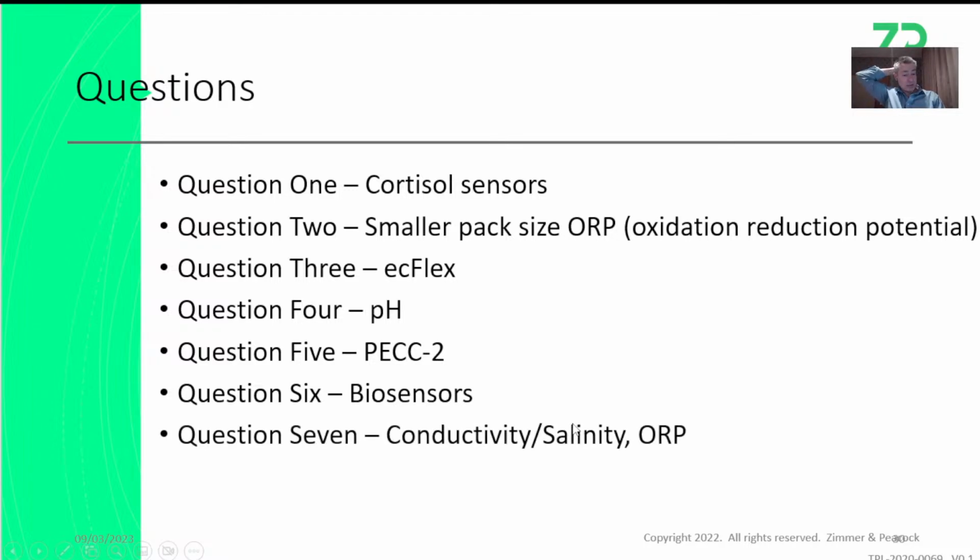And then number 7, you've got a medium of, let's say, cells. You bring in an oxidizing environment. That will generate reactive oxidative species, and then you can use a platinum electrode on the EMA potentiostat to try and detect that change in oxidation potential of the solution. I suspect that will work. Essentially, the more energy you bring into that oxidizing medium, the bigger the jump will be in the signal, and the easier the signal will be to detect.